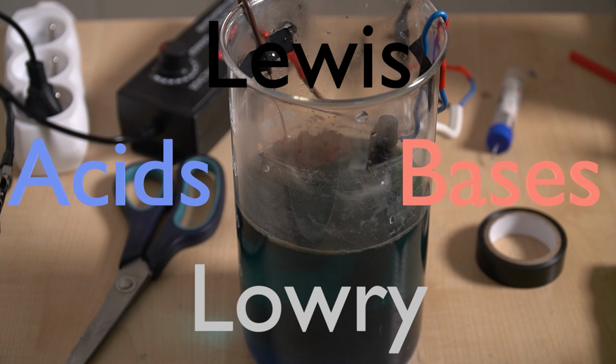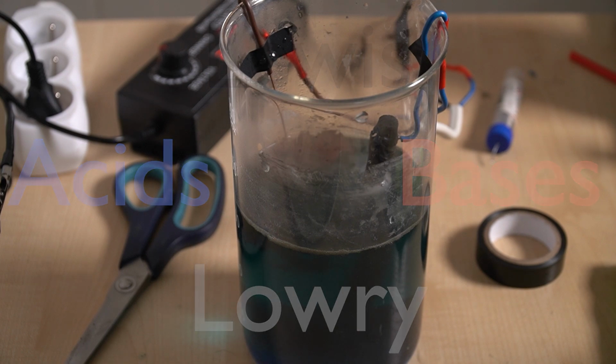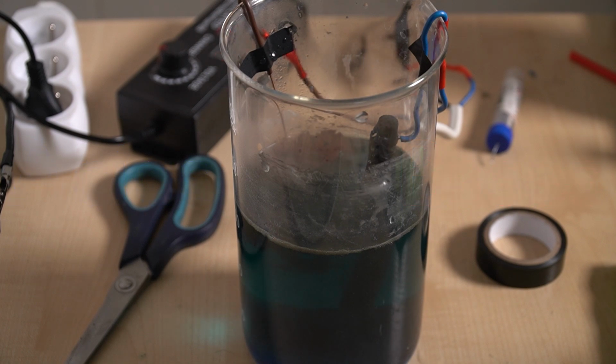And honestly, when it comes to acids, we'll have to wait for the organic chemistry video, because that topic is deep, but that's the basic idea, and that's how you should think of acids, not as these dangerous chemicals that eat away everything that's alive, only kind of like ions or salts. Because of the whole charge thing, they're actually extremely similar, so that's to say that depends on which one you're talking about. Anyhow, here's some more footage.